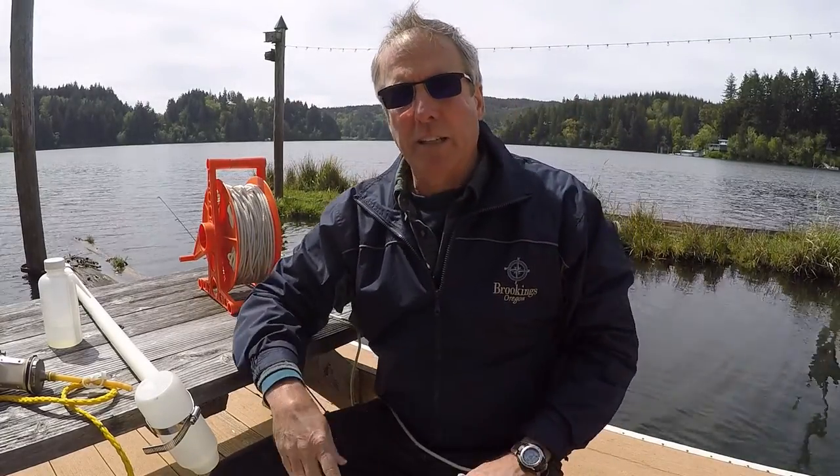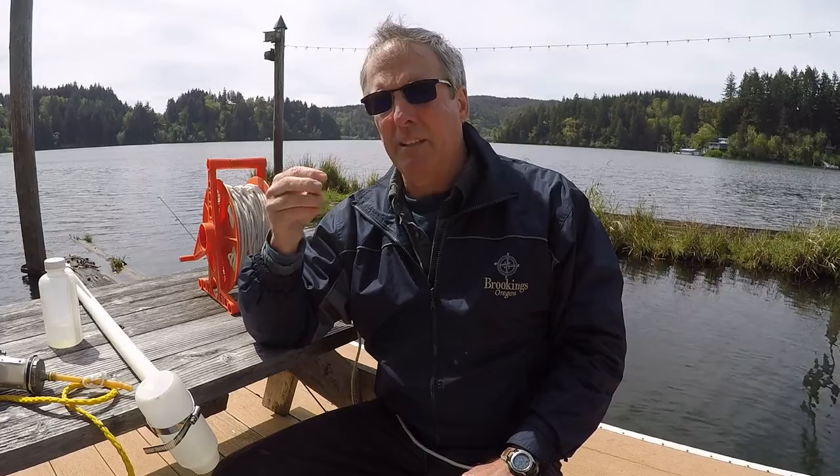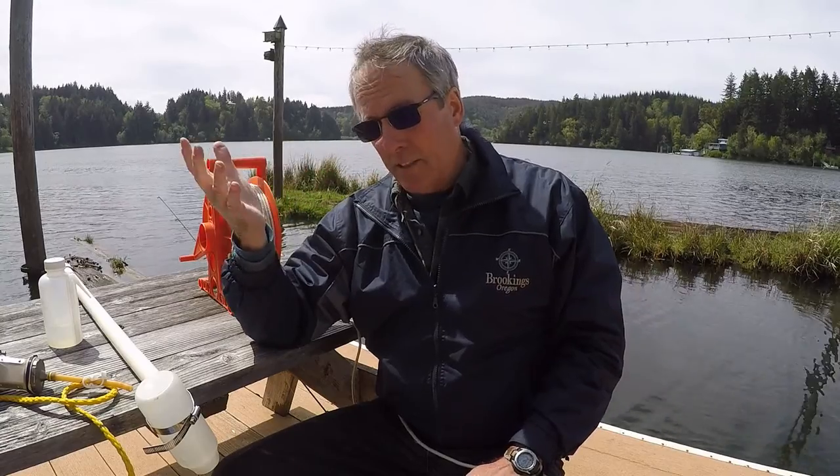It's just a little trick. If you don't walk it away or try to move it at least a little bit, you'll get some false readings due to the fact that once you hit that muck and all that sediment and muck kind of come up into the water, you start to immediately start changing things like your pH and your dissolved oxygen, potentially at least.